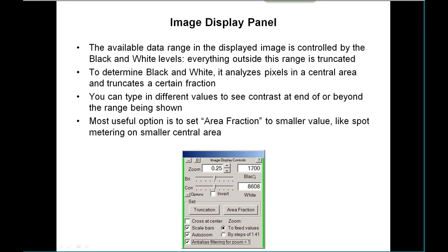The program analyzes the central area of the image, looks at the pixels there, and figures out what settings will truncate a certain small fraction of the pixels. That usually works pretty well. You can actually type numbers into these boxes if you want to see contrast beyond the range that's being shown.